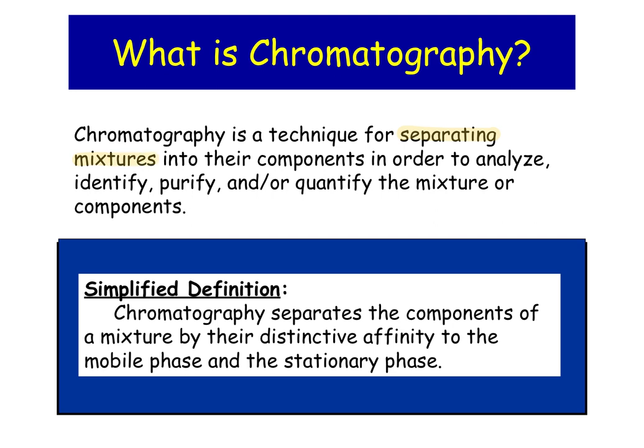So what that means is I have a liquid mixture. It's made of lots of different components, but I need to find a way to separate them out. When we're talking about liquid mixtures in particular, this can be really hard to do. So one of the techniques that we use for that separation is what is called chromatography.